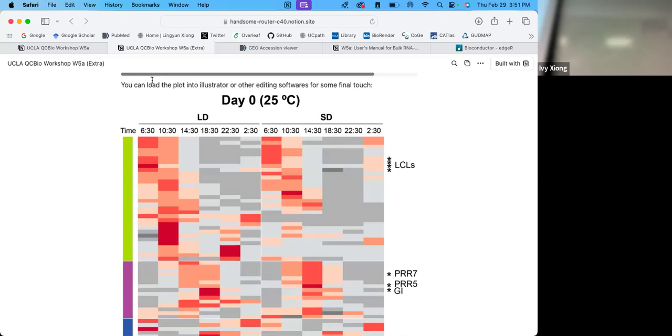So for me, what I did was, just replace what I found in my document, for example, and then the gene names. I made other folders for this next step.